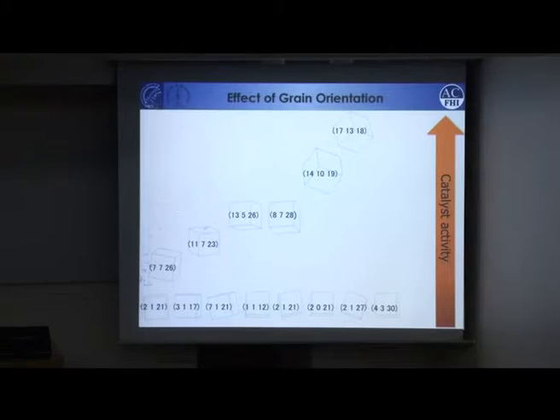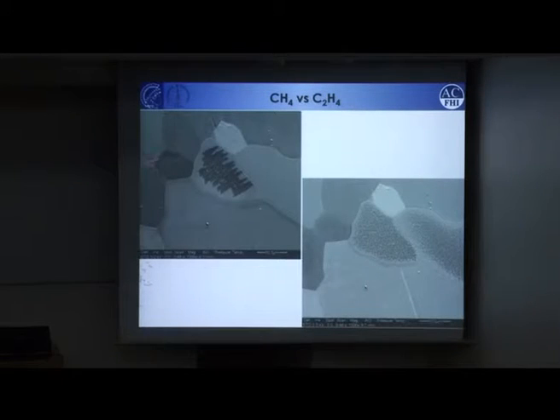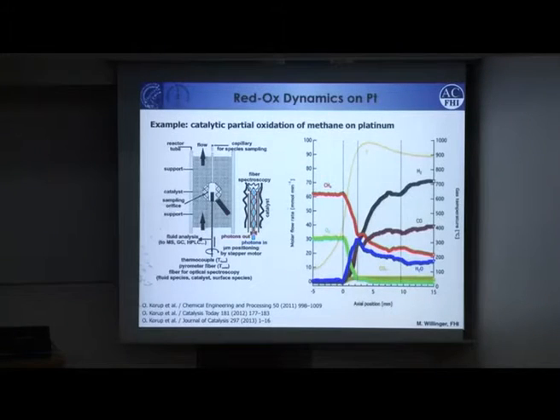And so now it was also interesting for my boss. We can, of course, in the microscope, we have the foil. We can change to different precursors and see how different hydrocarbons have different stabilities, and you can see how they are changing the nucleation behavior of the graphene and all this. Just before I conclude, I want to show you one example directly from real catalysis.